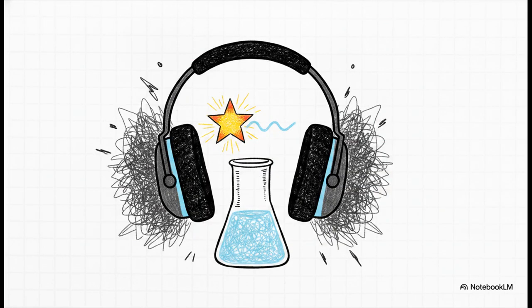Commercialized back in 1975, the suppressor is an absolute game changer. It acts exactly like a pair of high-tech noise-canceling headphones for the instrument. Its entire job is to eliminate the background ions in the mobile phase via acid-base type reactions before the liquid ever reaches the detector. It completely silences the background noise so the sample can finally shine.